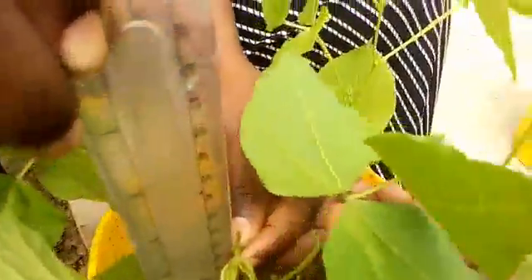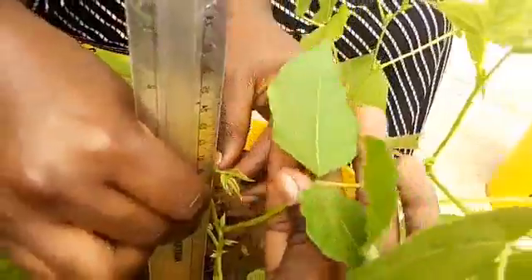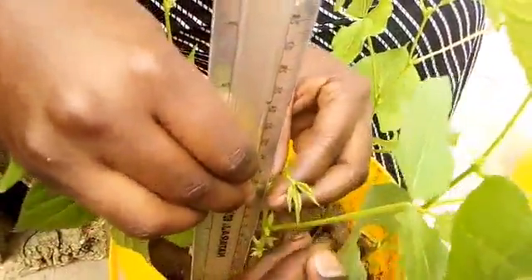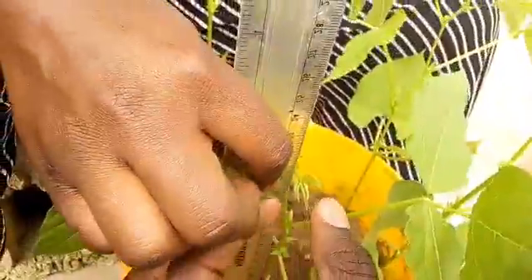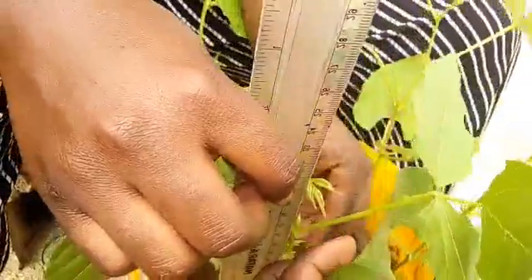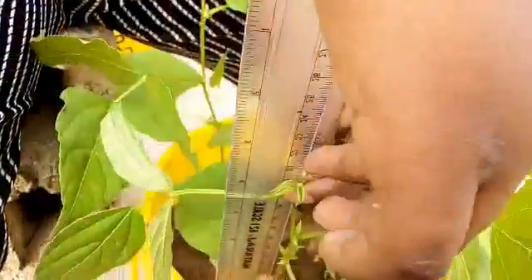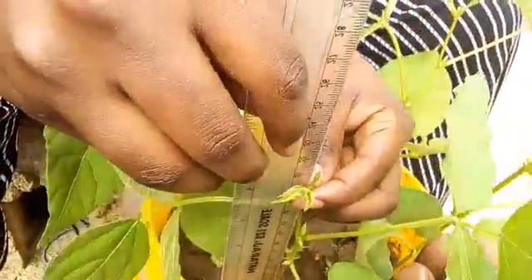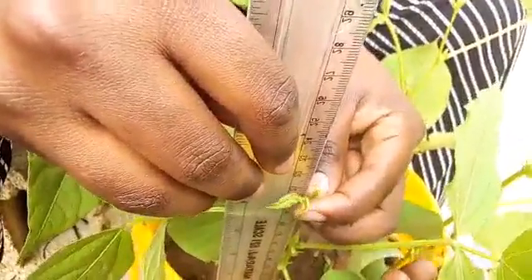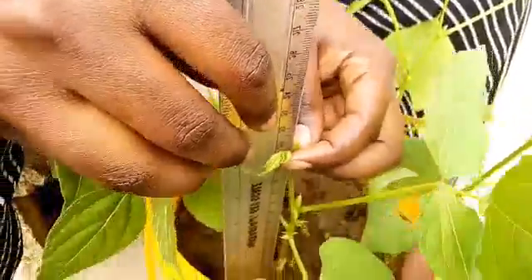It has this highest point, but we can't take that because that's a leaf that's coming from this point. So there's this highest point, and then we cannot take from here. We're taking from here where the shoot. Yes, what we are following is the shoot height. You follow the shoot where it leads you to the highest point. That's there, because you can see these 2 leaves are trying to branch off that point. So that's the point that we're taking as our shoot height. So we can say that is 19.9.